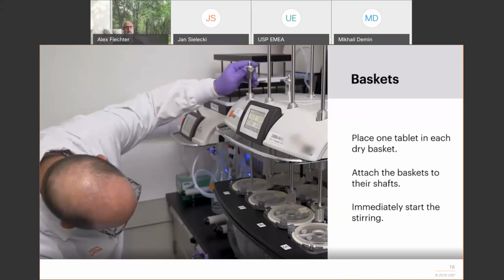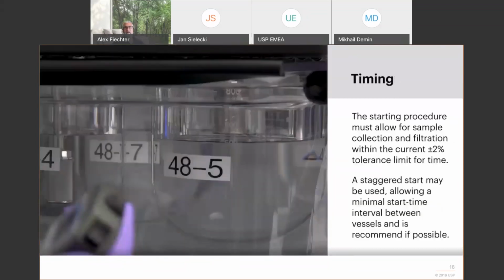You can do an immediate start by introducing all six baskets at the same time, but you can also do a staggered input and then accordingly take the samples according to the time differences to which you have inserted the baskets. Timing is important because remember, when we take a sample after 30 minutes, the prednisone tablet has only released about 40% of its whole content.